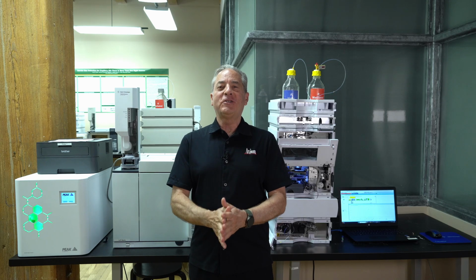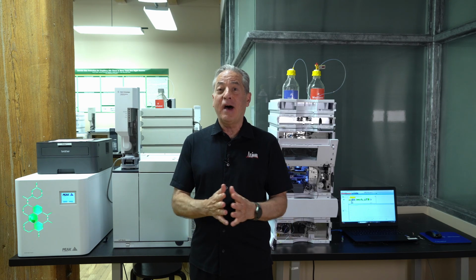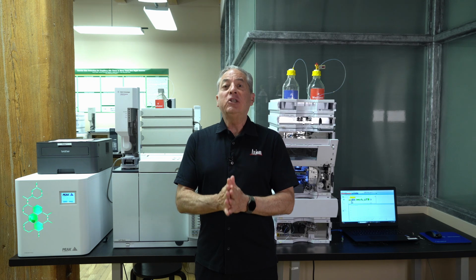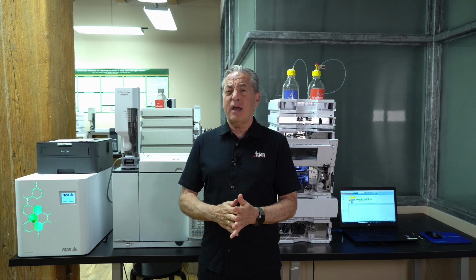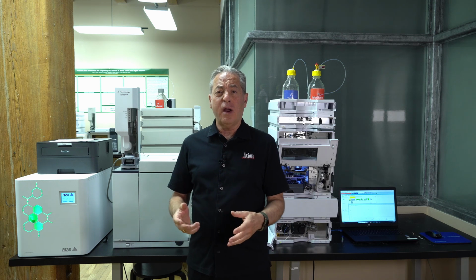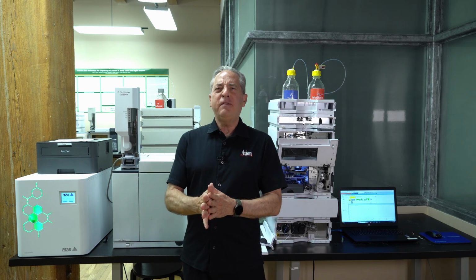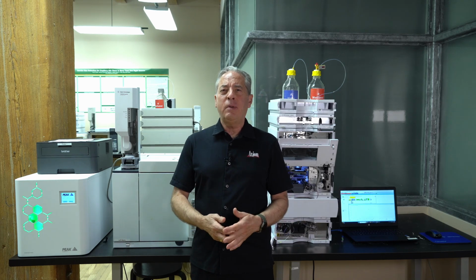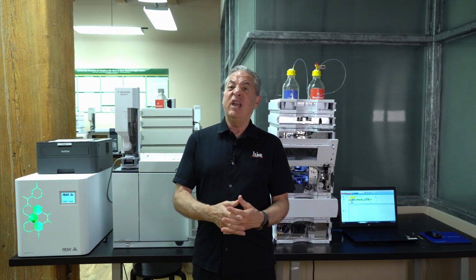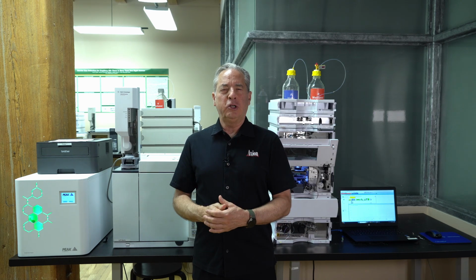How do you know what question the interviewer is going to ask you? Now, we're never sure of what they're going to ask, but here's a clue. Look at the job description, what words they use. If they say something like GC maintenance experience required, then you better study up on the components of the GC. If they ask something like HPLC method development as part of the job, then you really want to brush up on the HPLC method development stuff, not only the components, but the method development procedure itself.